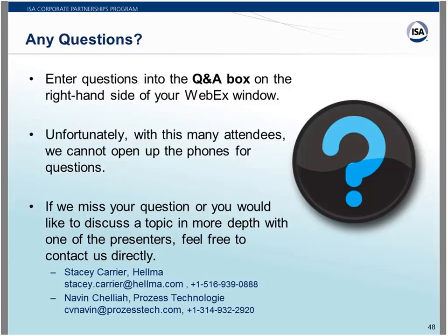So, no, they don't. There are some analyses that are so incredibly simple that you can just say, hey, we have this level of signal, it corresponds to this. But it comes when you have a complicated matrix. Water in flour or something like that has a very complex spectral signature. So in order to get the water bands out of that, you actually do need to run a model in order to do this.